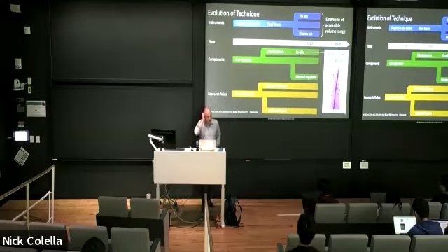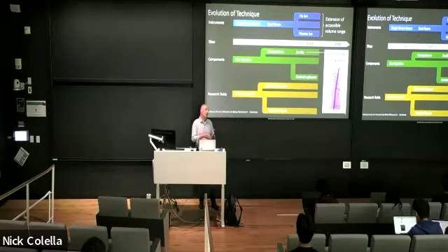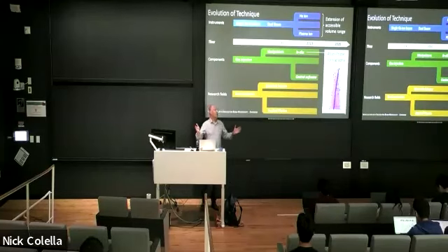And this was, for example, a crucial development to make a technique called atom probe tomography, that my colleague Austin Akey is responsible for and can help me with, really accessible to a broader range of materials. Before, atom probe was very much limited to metallic samples because they could be drawn into tiny shapes that were needed for the technique. And with the focused ion beam, one could suddenly prepare the material for all sorts of materials.